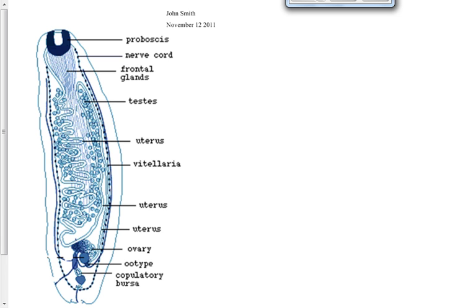So the first and most important rule of drawing a lab diagram: they're always drawn in pencil. Always. You never draw a lab drawing in pen. You always draw it in pencil. And they should take up the whole page. It should look like this.